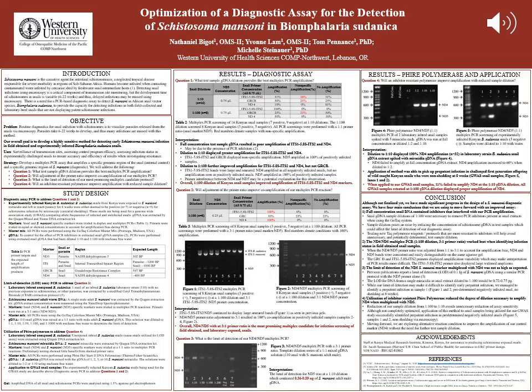Our goal is to develop a diagnostic PCR assay for accurately detecting Schistosoma mansoni DNA in the African snail vector Biomphalaria sudanica. To do this, we addressed 4 questions. The first question: what sample dilutions provide the best PCR amplification?